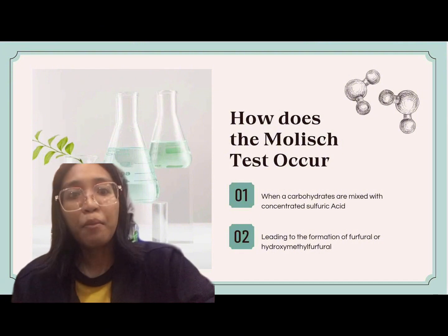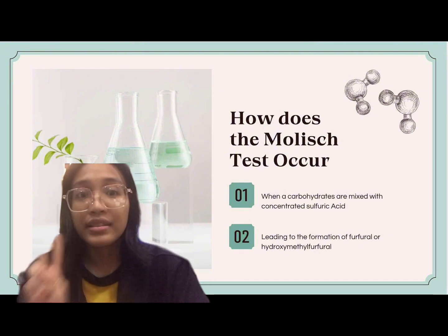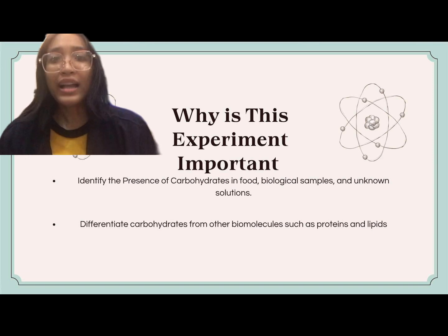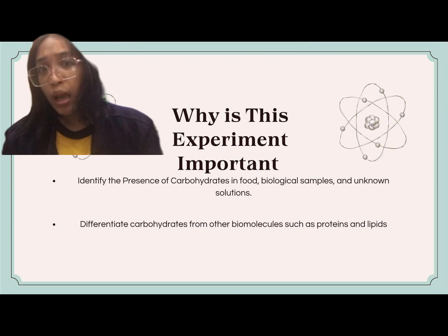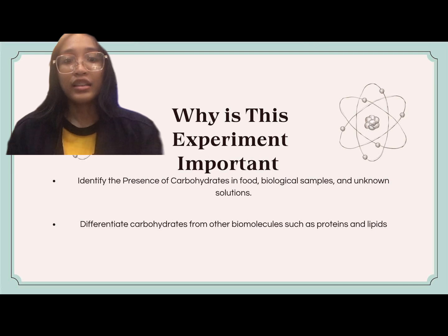First, carbohydrates are mixed with concentrated sulfuric acid. Second, this leads to the formation of furfural and hydroxymethylfurfural. So third, why is this experiment important? First, it identifies the presence of carbohydrates in food, biological samples, and unknown solutions. Second, it differentiates carbohydrates from other biomolecules such as proteins and lipids.